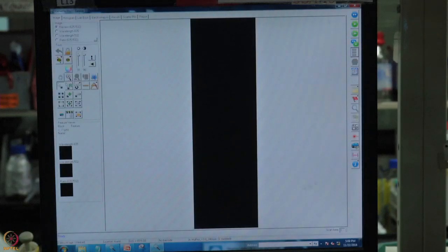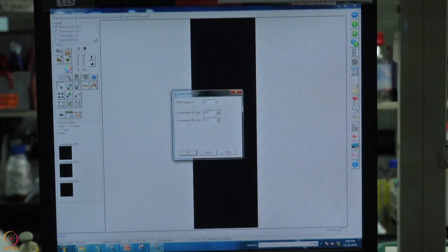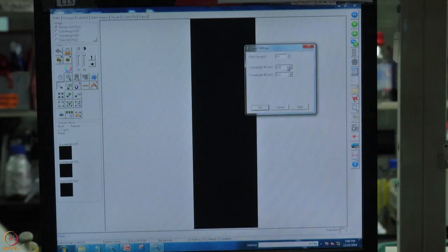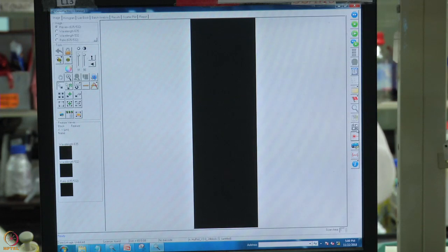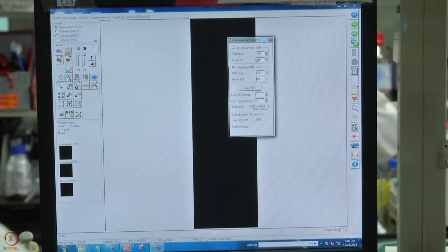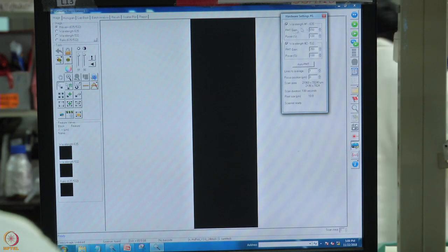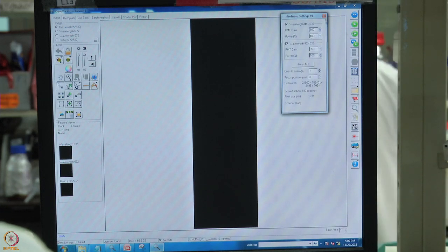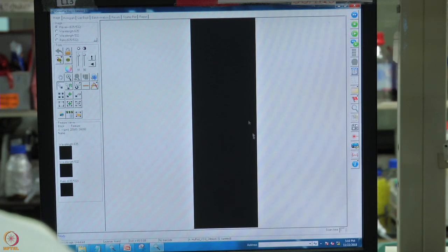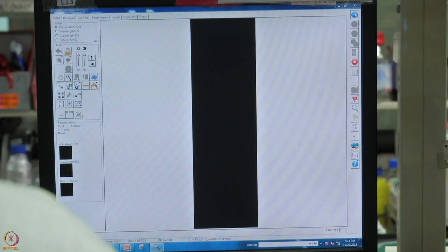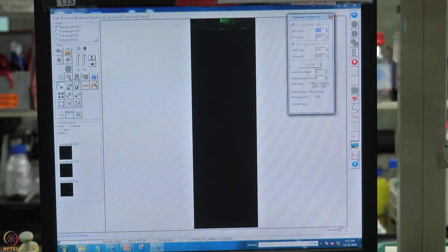This is how the interface looks. Since it was a dual-channel experiment where both antibodies were used together, we scan at 635 nm for Cy5 labels and at 532 nm for Cy3 labels. Once we set the parameters, we can also adjust the PMT gain, which tells you the saturation or the spot intensity of the slides.